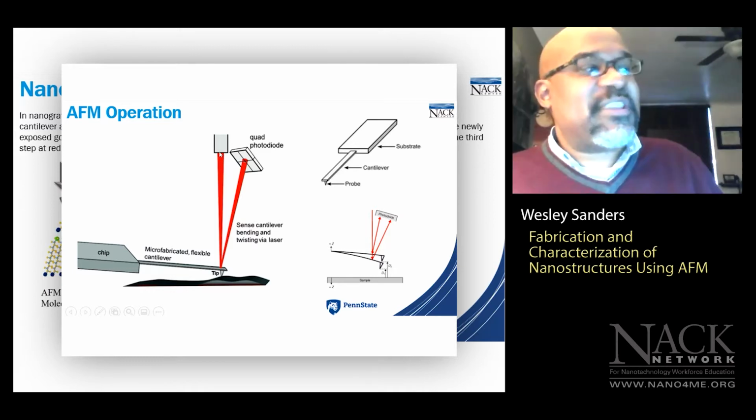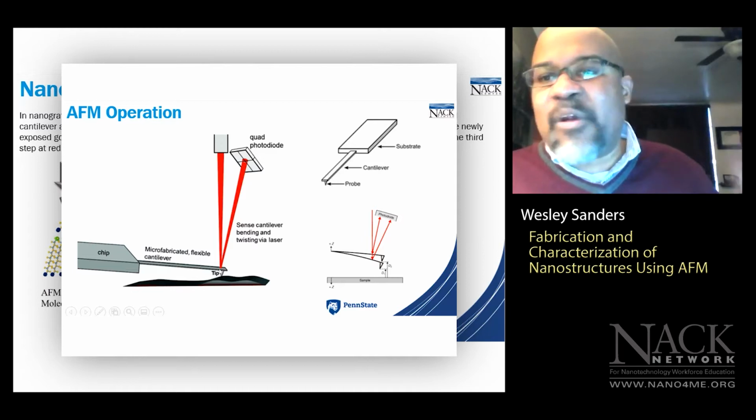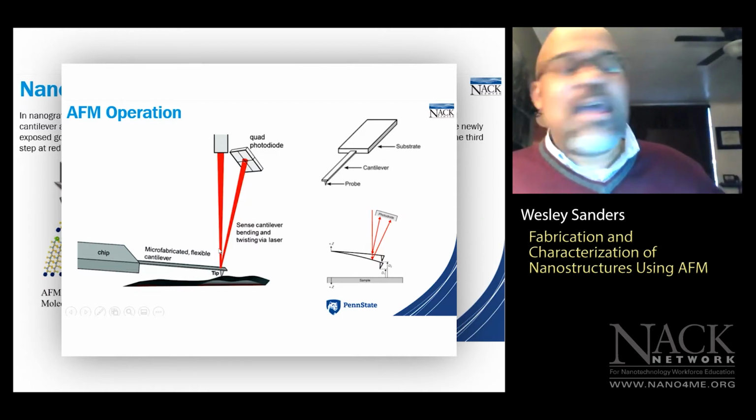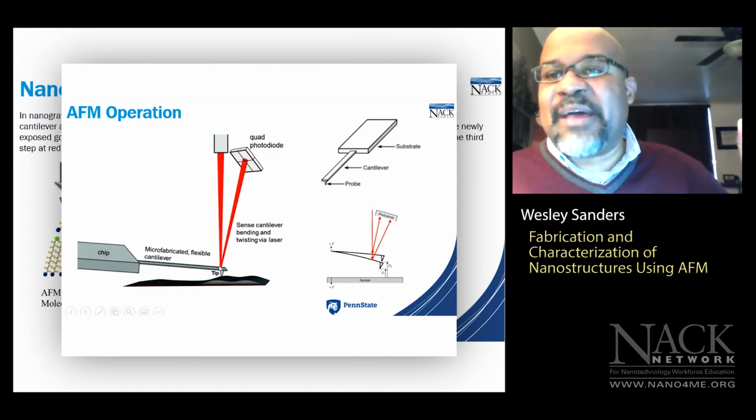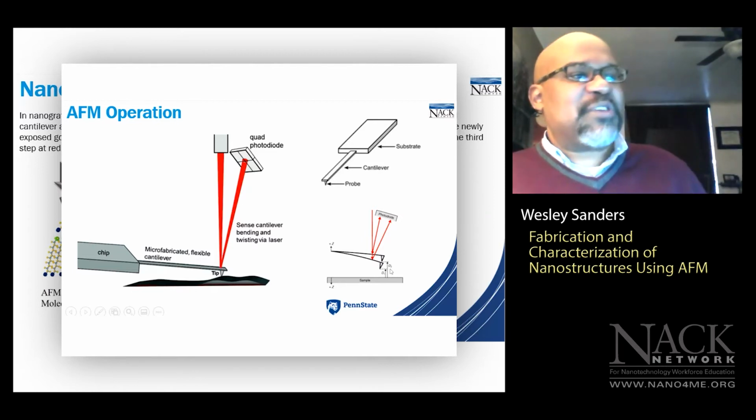Right, we're dealing with extremely small laser power in this case, because again, we're not using the laser to move the cantilever or manipulate the surface in any way. We're simply using the laser as a means to track the tip motion as it moves across our sample surface. And the laser footprint is so small that it's only hitting the cantilever?